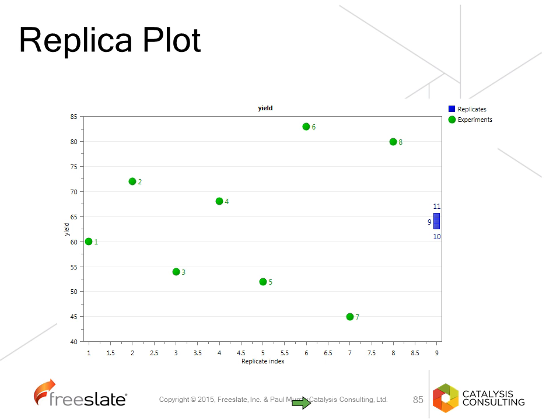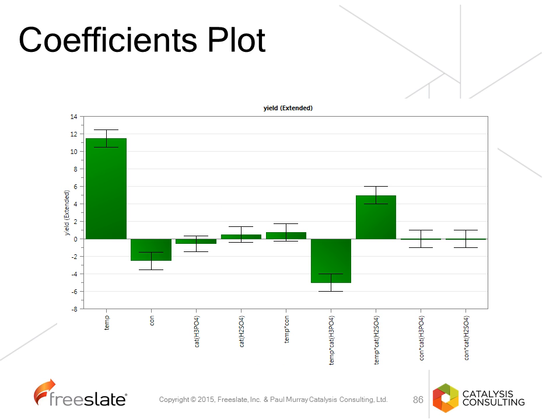So based on this, we take it forward, and we can work out which factors are important. So we have temperature is hugely significant in this reaction. So this green bar, temperature here, is showing the coefficient. The size of this green bar is telling us how significant it is. We have an error bar on this because we've carried out a replication.